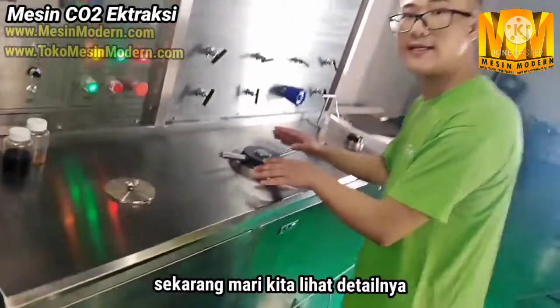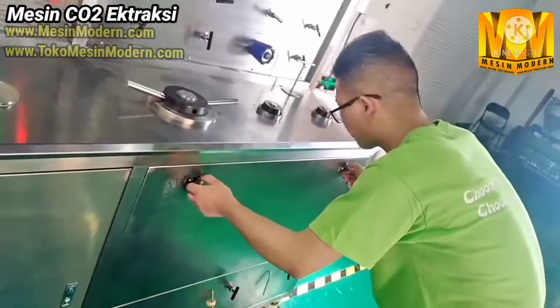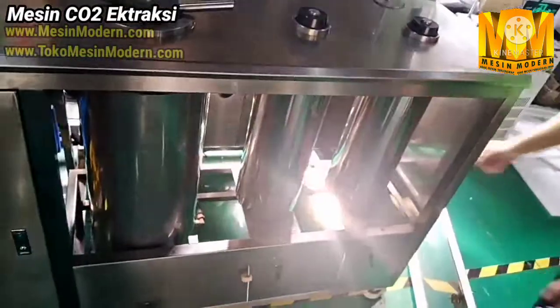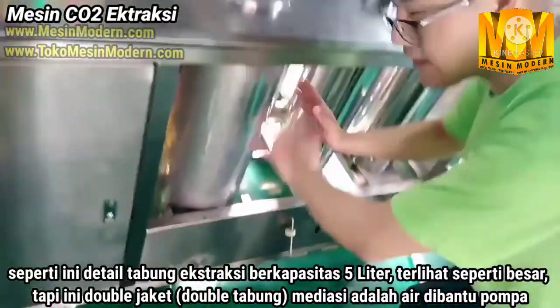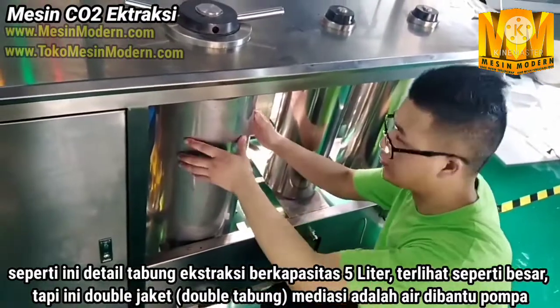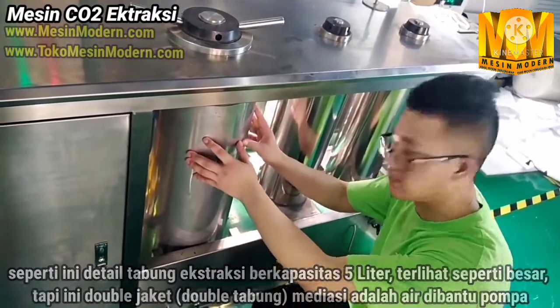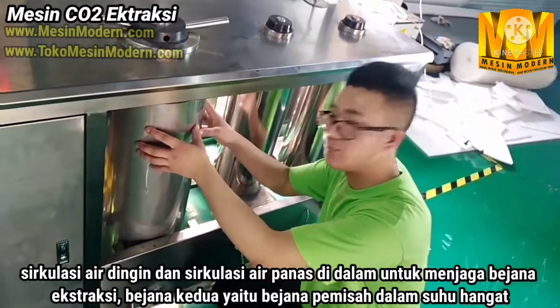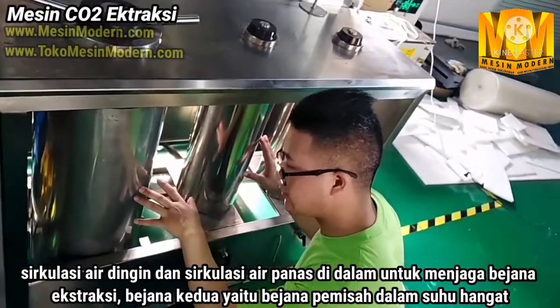Now let's look at the details of the vessels. As mentioned, the vessel is five liters capacity, but you can see it's very large. Actually there is a jacket around the vessel, which is why it looks large. Inside the jacket is water — with the help of the water circulation pump, the hot water will circulate inside to keep the extraction vessel and also the separation vessels at the warm temperature you desire.